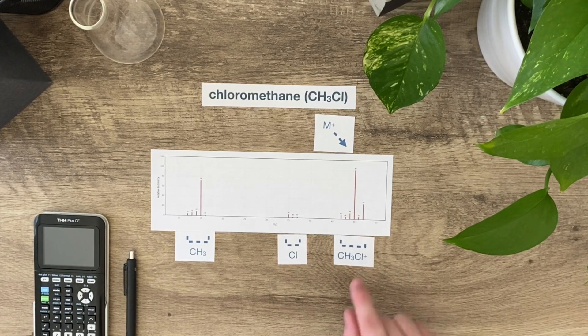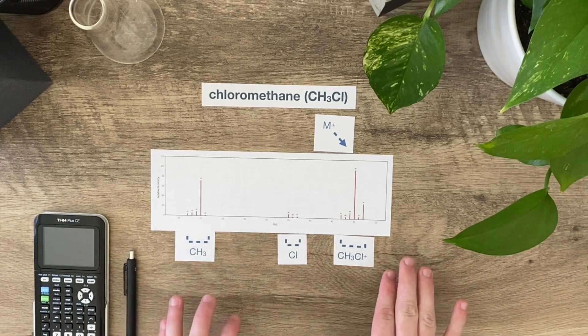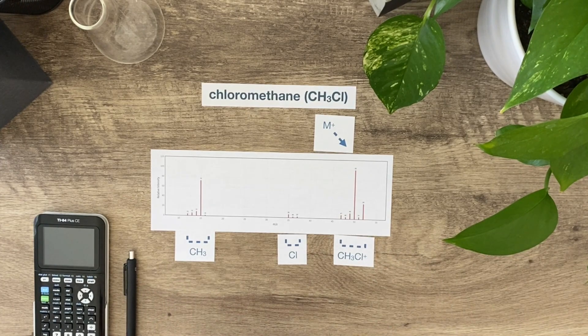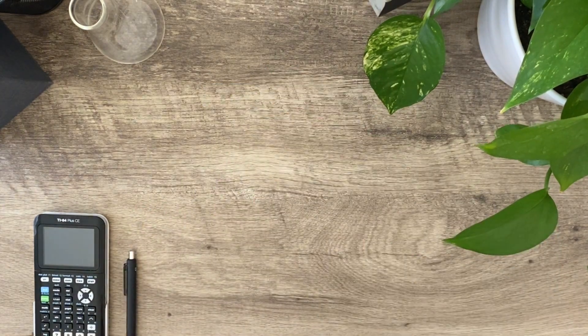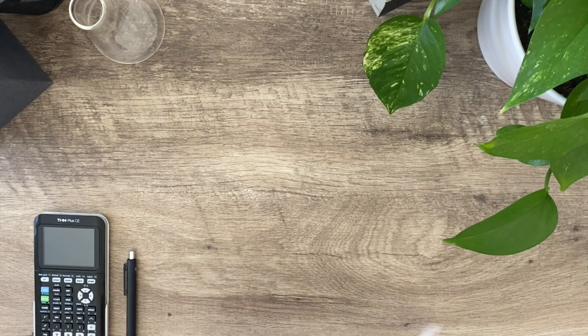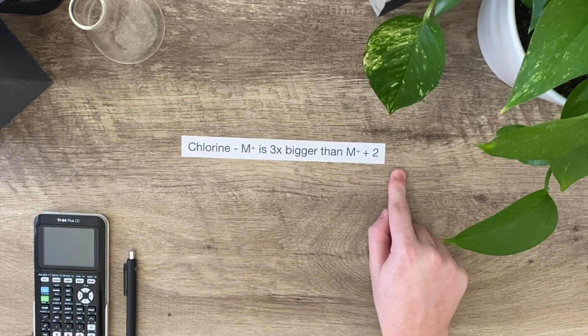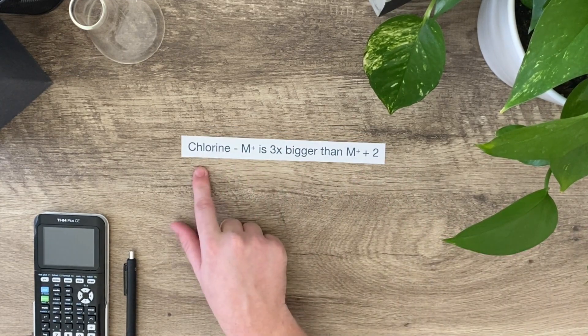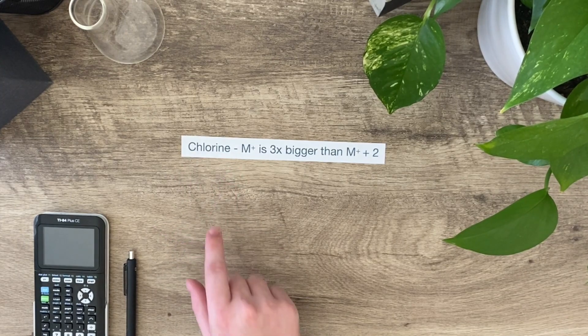There are other shortcuts that we can use when we look at a mass spec to figure out whether a chlorine is present, a bromine is present, or a nitrogen is present. Let's look at them. Chlorine we just went over. If the M+ peak is three times higher than the M+2 peak, meaning two peaks past the M+ peak, three times bigger, a chlorine is present. That's because of that 35-37 relationship.